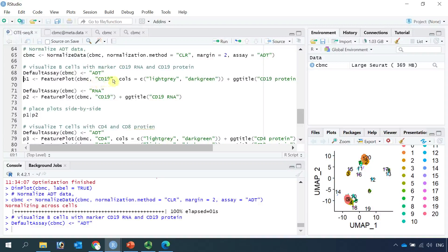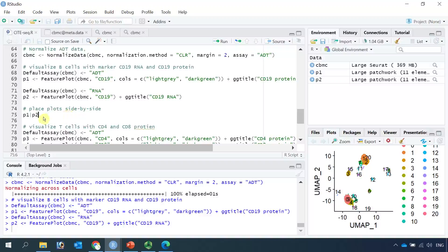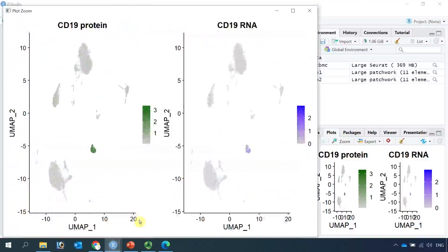We are going to use CD19 to identify B cell clusters because CD19 is a marker for B cells. We generate the antibody plot as plot one with the title 'CD19 protein'. Then we set the default assay as RNA and generate another plot as plot two to see the CD19 RNA expression in the cell clusters. Now we visualize plot one and plot two in the same figure. You can see both CD19 protein and CD19 RNA label the same cell cluster.